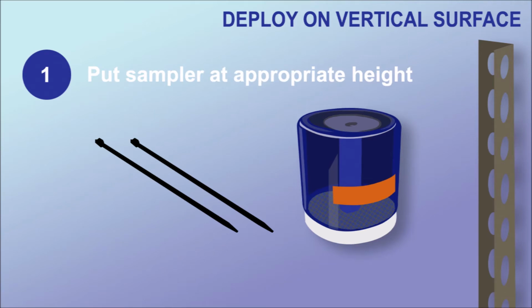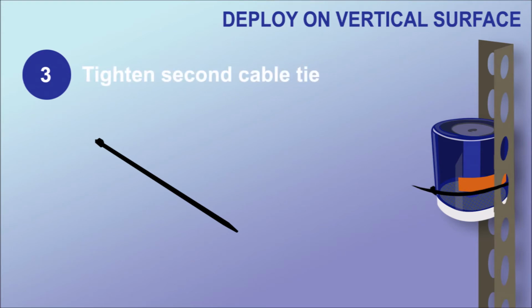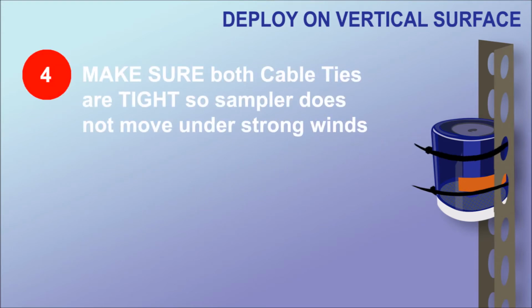First, put the sampler at the appropriate height. Next, tighten the bottom cable tie, positioning the sampler. Tighten the second cable tie. Finally, make sure both cable ties are tight so the sampler does not move under strong winds. Take note of the date and time.